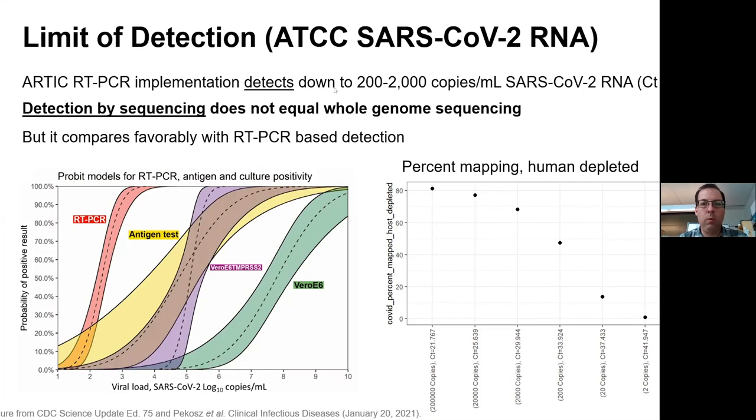So what we're seeing with the whole genome assay, given that it's the same basic technology plus a library prep on the end, is actually in the range of success for this kind of diagnostic assay that's based on RT-PCR.